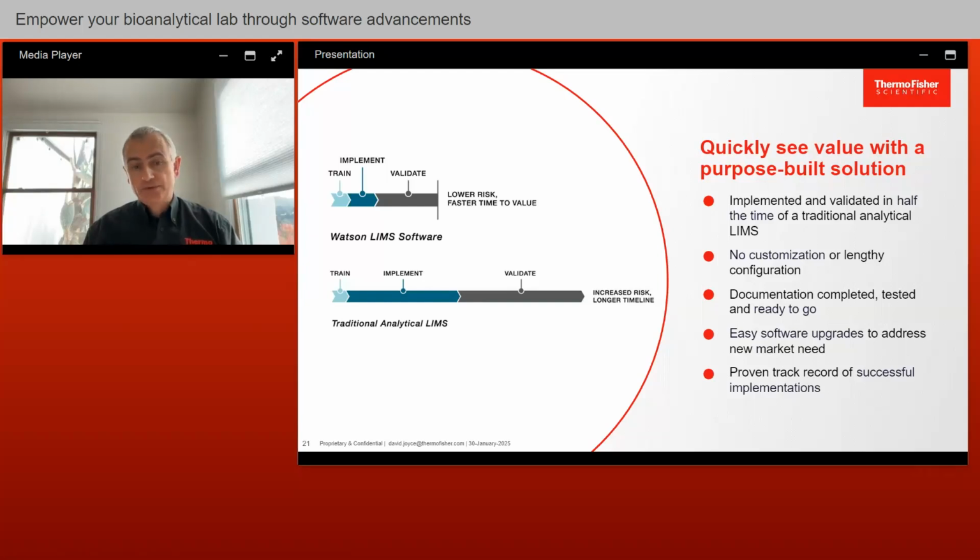Typically that can be a matter of months to carry out all of the tests on the detailed functionality of a system. It could be tens of months if you're doing it on a custom system. We hope to be able to compress that into weeks, if not shorter time frames, at least for the OQ testing.